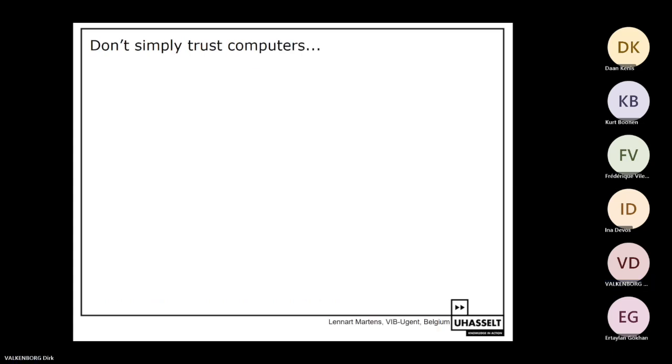I want to conclude this session again with a few slides. This one is an interesting slide I got from Lennart Martens from Ghent. What should we learn if we do database searching? Well, we try to automate a lot of our work and try to interpret our data in an automated way. This workflow makes a little bit of abstraction of the spectra, so we don't look at the spectra anymore. We look at the identifications and the proteins found.